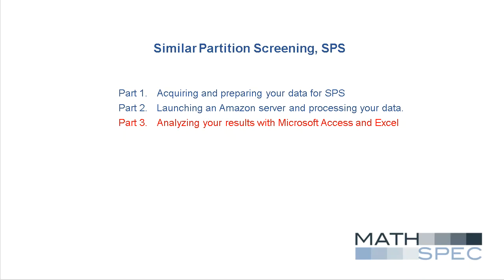I'm Dan Sweeney from MathSpec. In the part 1 video, I discussed acquiring and preparing your data for SPS. In the second part, we launched an EC2 compute unit on Amazon AWS and processed some data files on it. Now in this final video, I'll go through importing the results into a Microsoft Access database.